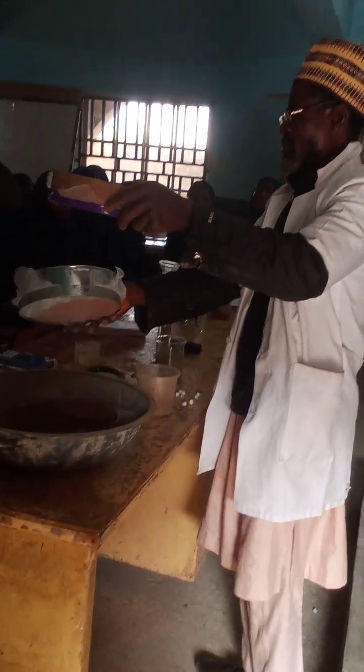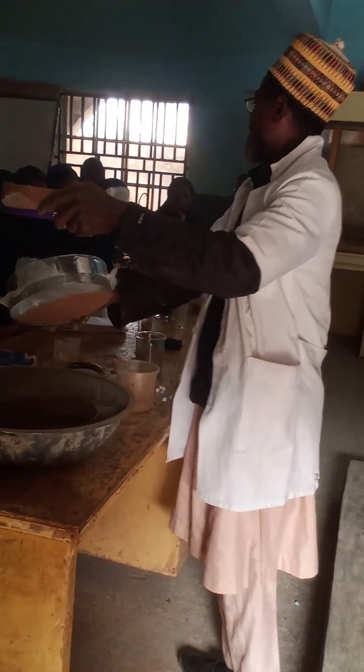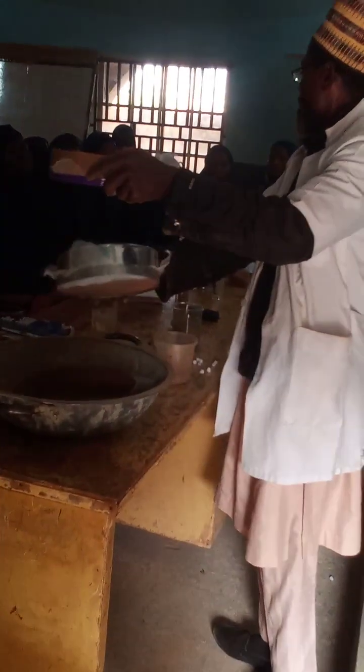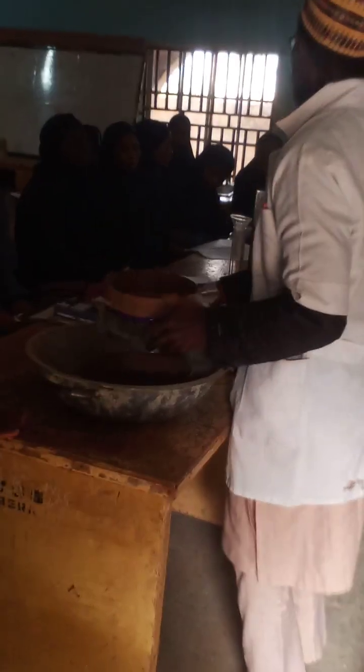And you look at this one now, meaning that this particular soil sample has the largest particle size because it holds a lot of particles. Look at it. So that is another method of determining the soil particle size. Is that clear? Good.